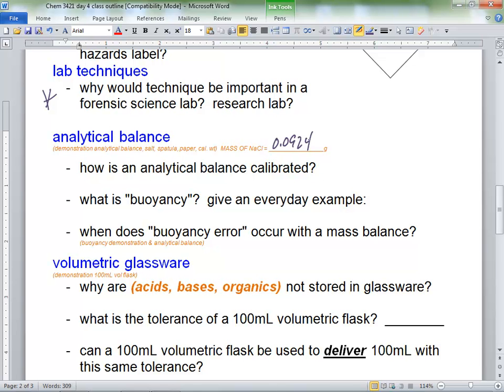0.0924. Okay. And if you wanted, really, to prep us for what's coming up in the future, you may not take P-chem, but this is always subjective. What's your error in that measurement? Well, a lot of times if he's bouncing around the last digit. He's not even bouncing around. But I guess you got to give him some kind of error. This is where it's subjective. Do I put a 1 here? Or do I, right, because that would follow with this digit. But he's not bouncing around. So I could go even further and say, put a 0 in there and say a 5 or something. That's kind of subjective, this whole error thing is.